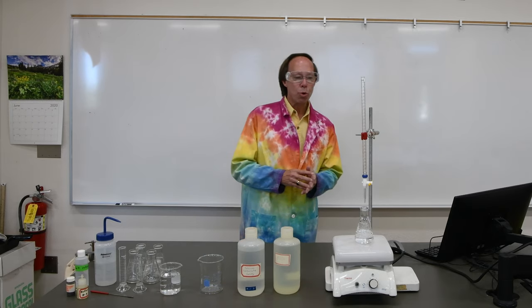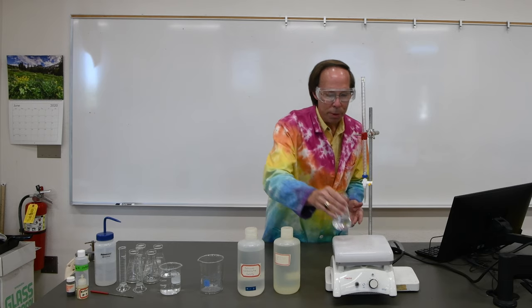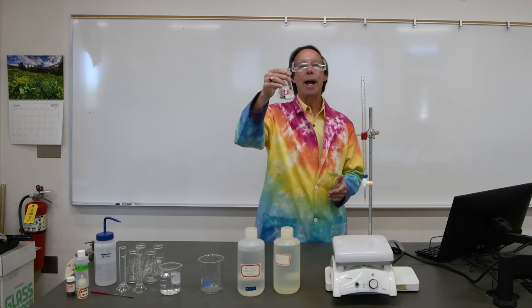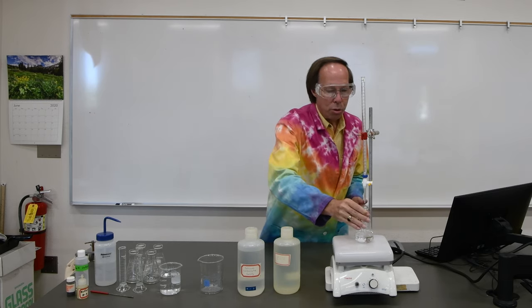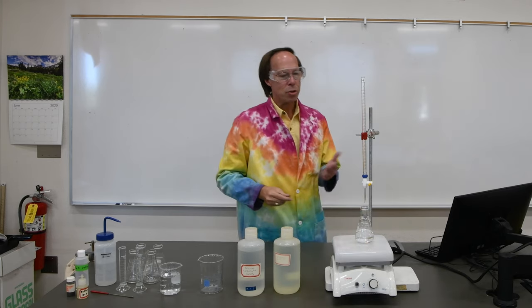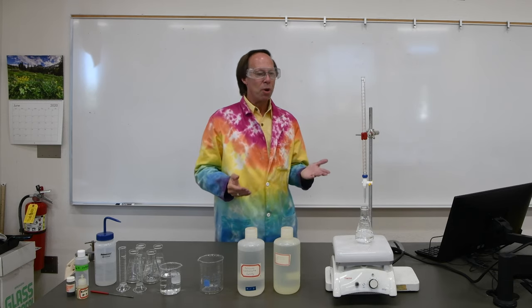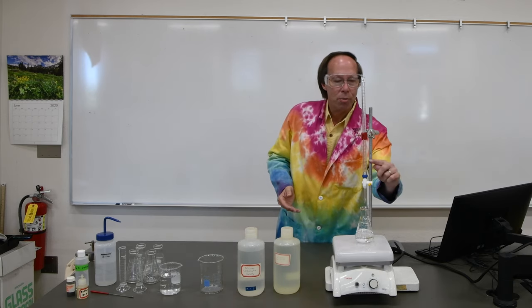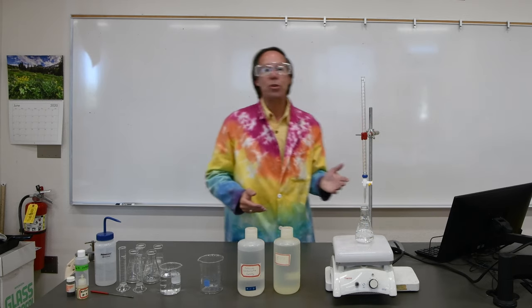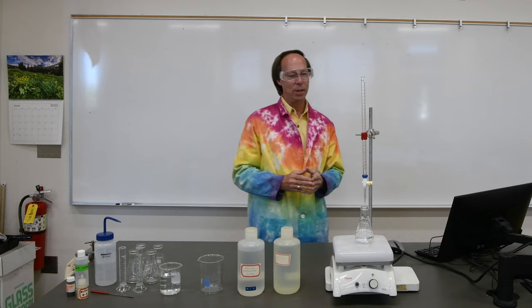The way a titration works is pretty straightforward. Our unknown solution will be in an Erlenmeyer flask. And our known solution will be in one of these burettes. A burette is a device that allows us to measure quantities of liquids very accurately. We can measure the volume in this burette to the nearest hundredth of a milliliter, so we can get a very accurate measure of that.